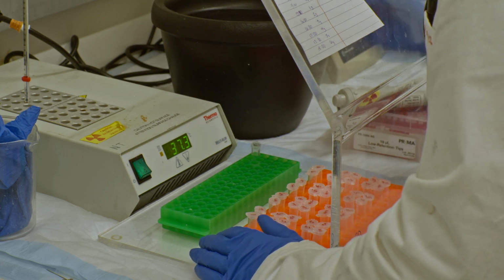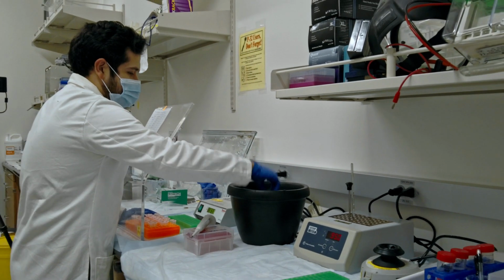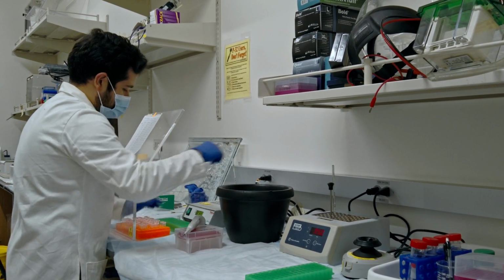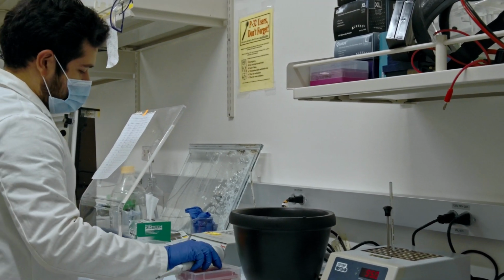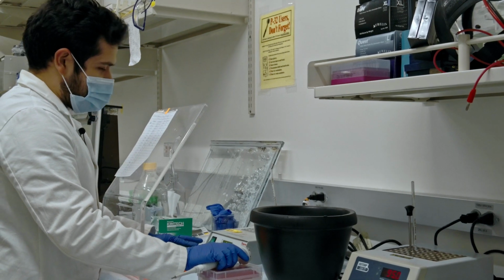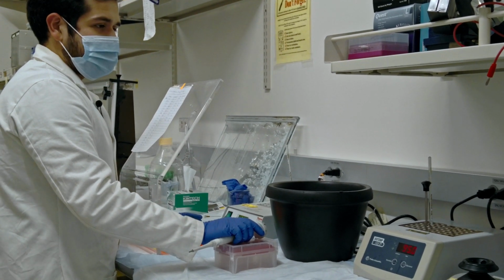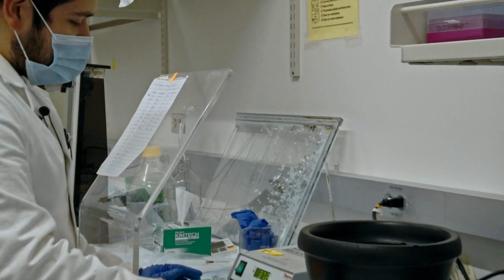to do is to anneal that primer onto a template strand. So in this case, I have two other samples here that contain two different kinds of templates where my primer is going to attach. In this case, one of the templates is just a control DNA, and the other template, for example, is a DPC, so it contains a DNA adduct of some sort.